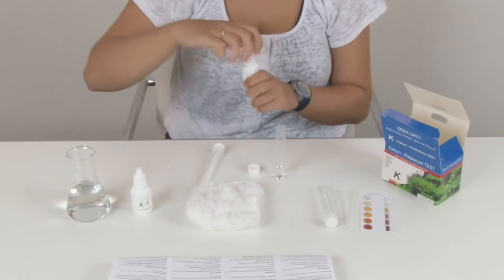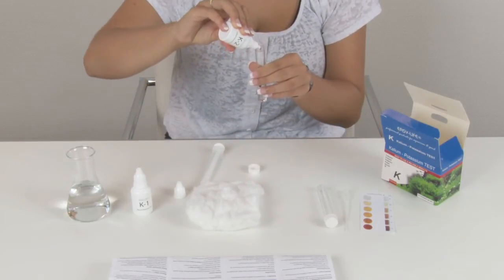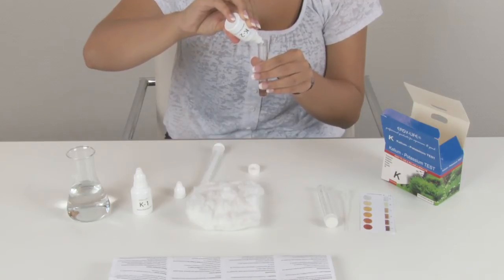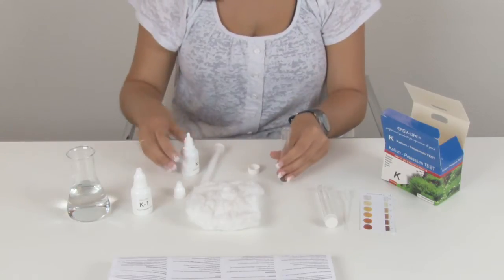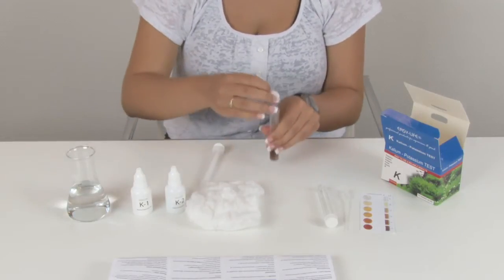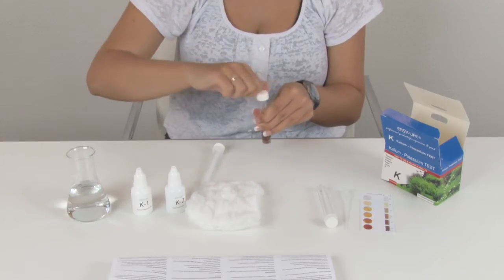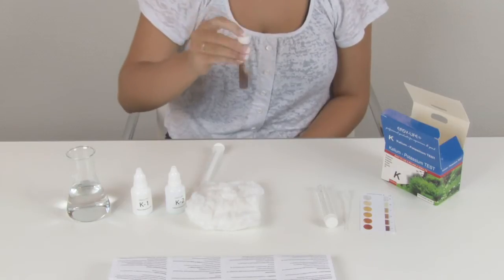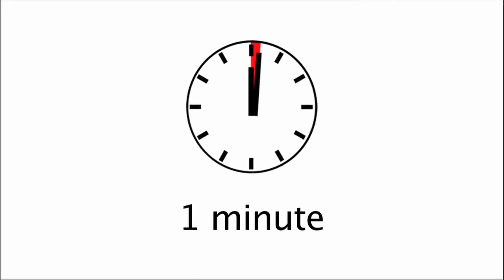Shake first and add now 10 drops of reagent K2 under a 45 degree angle. Cap the test tube and shake it for a few times. Wait for 1 minute before proceeding.